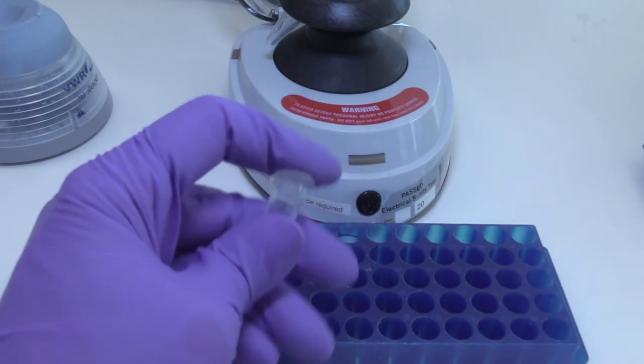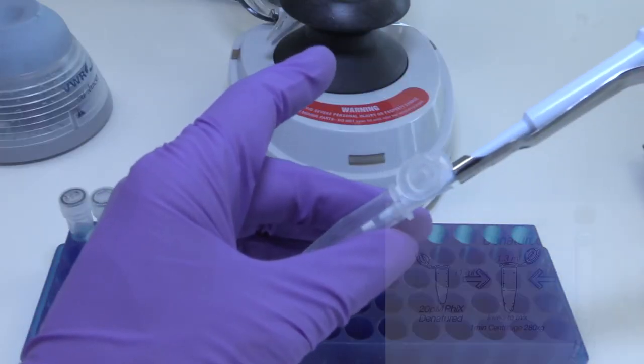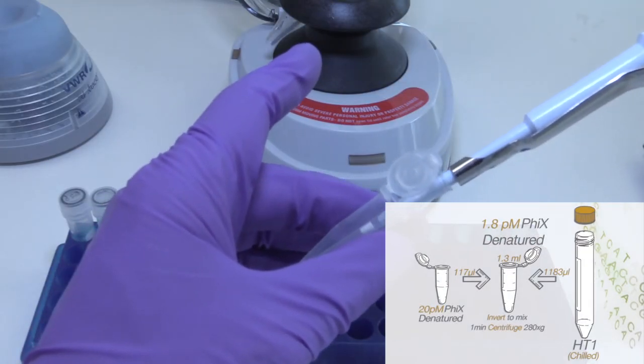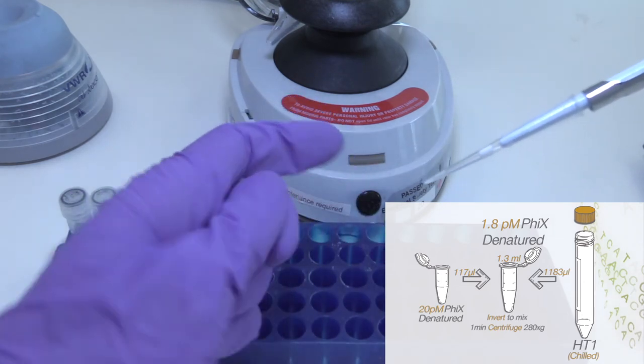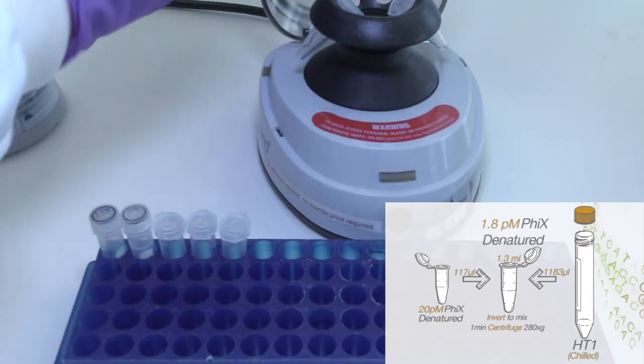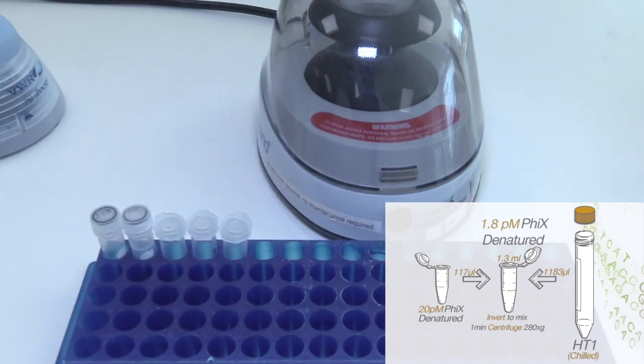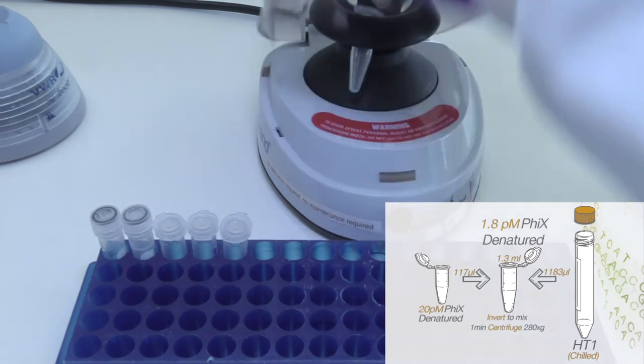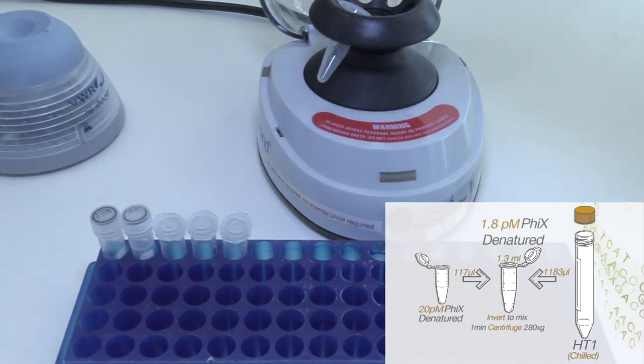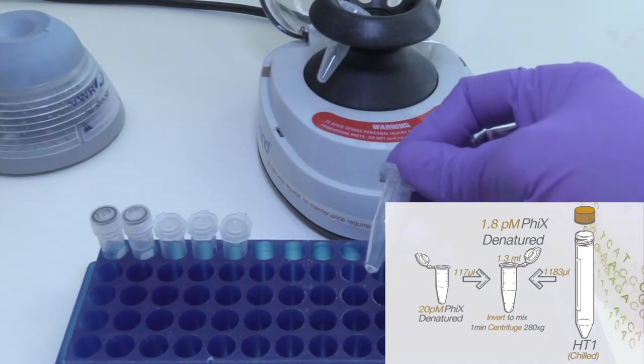Further dilute the denatured 20 picomolar Phi-X to 1.8 picomolar as follows: Combine 117 microliters of denatured Phi-X and 1183 microliters of pre-chilled HT-1. Invert to mix and then centrifuge at 280 times G for one minute.